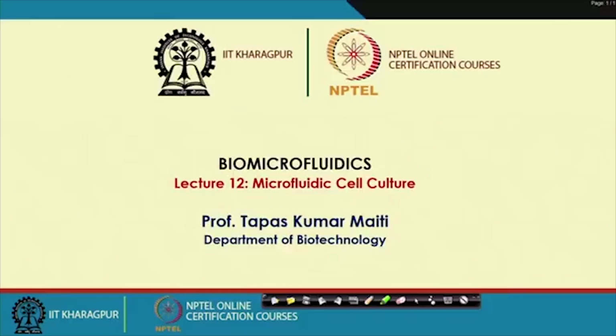So, in my previous lecture I had mentioned the importance of cell culture, particularly in the microfluidic system. Then I had discussed how microfluidic channels or wells could be constructed using that PDMS based elastomeric matrix.